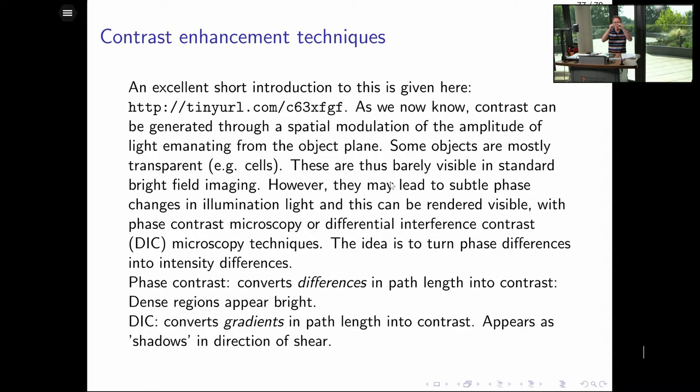If you go through a small cell, maybe 5 to 10 microns in thickness, the light will have slight phase changes, because the refractive index of the cell, the membranes, the organelles, the nucleus, the cytoplasm inside the cell, all have slightly different refractive indices than perhaps the water medium that they reside in. And so that's why you can see slight differences, because the light gets slightly refracted. That's what gives you the signal, but it's very weak.